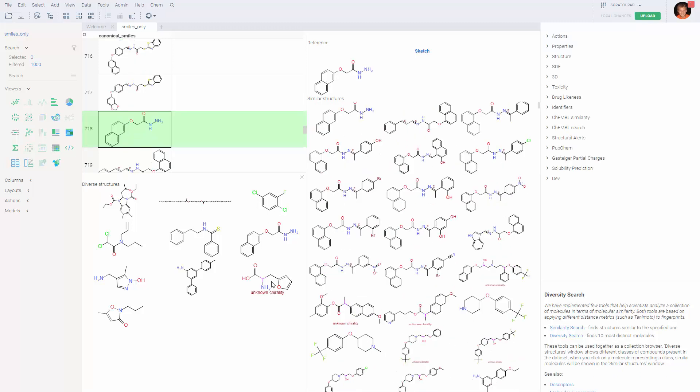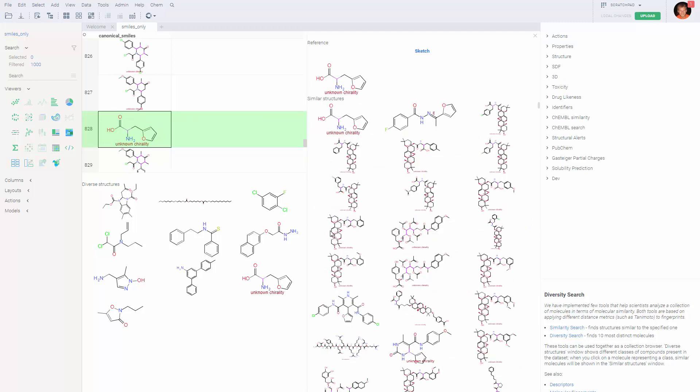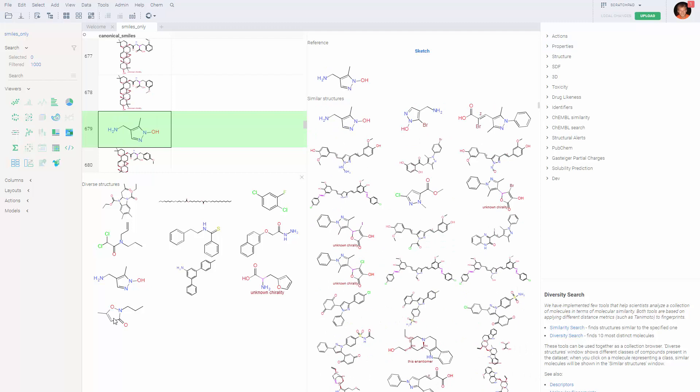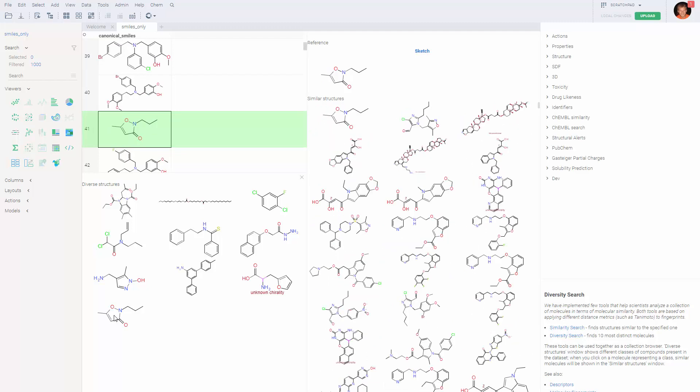We will just click on different classes and see different examples of it. This is it for this video. In the following videos, we will discuss how to run similarity search and substructure search against databases. Thank you.